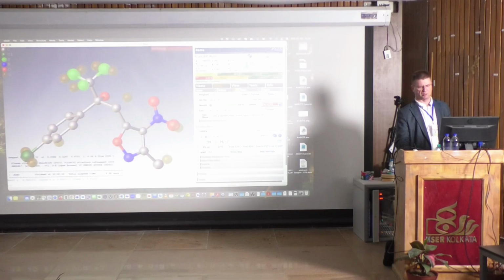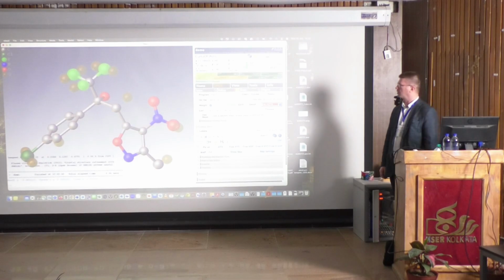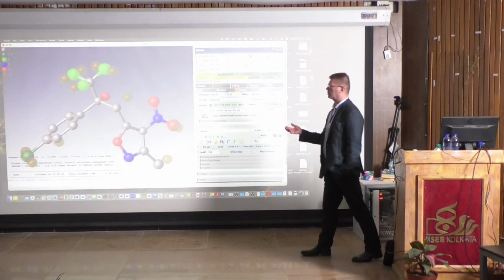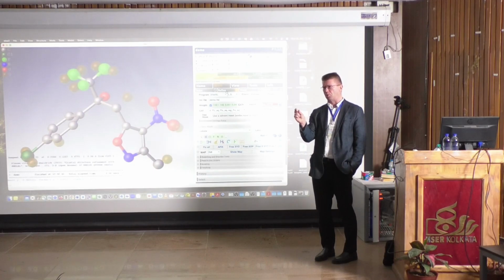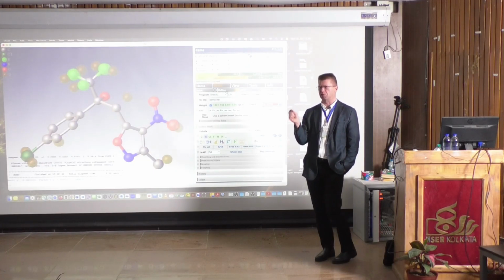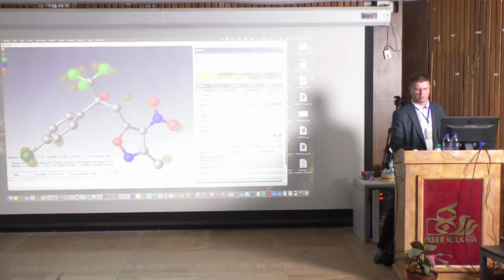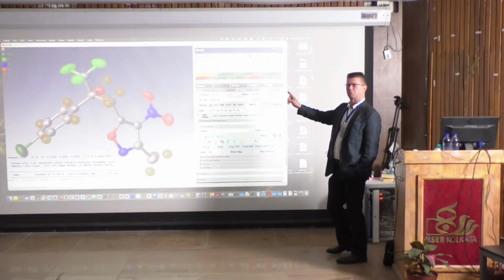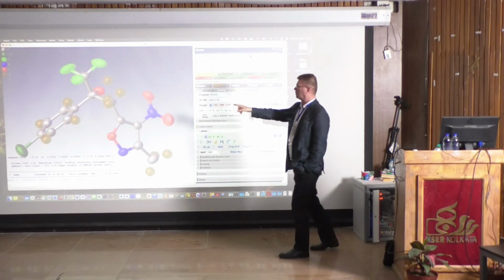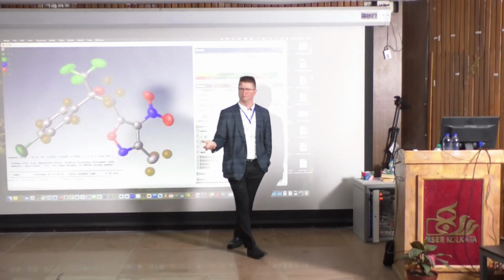So I will redo this. Now it went to green. So now we have all the atoms, but we have the isotropic thermal movement, which is the ball. So we have to change that to anisotropic, so that we take that into account. And that was this knob in here. So I will click this, it did it, and now we can see what happened. The R value dropped to 7, and now the shape of the atoms changed to ellipsoid.